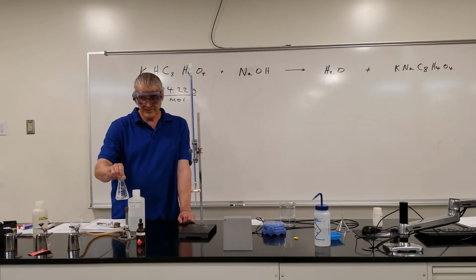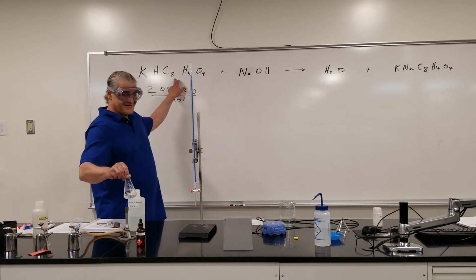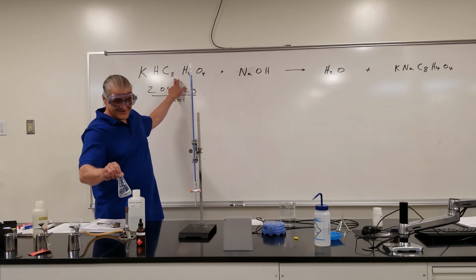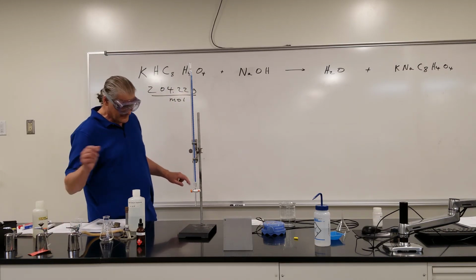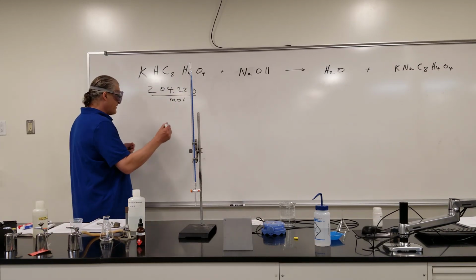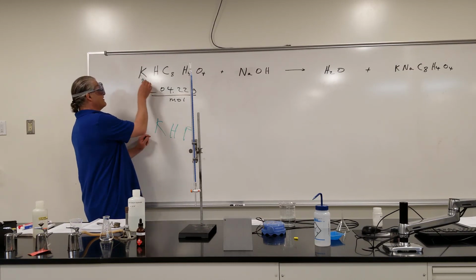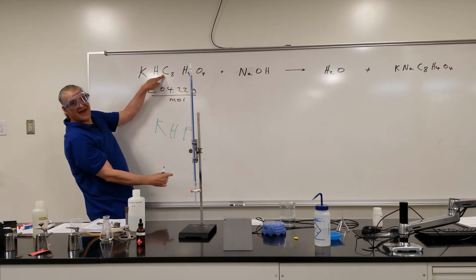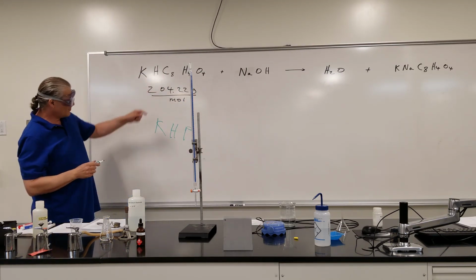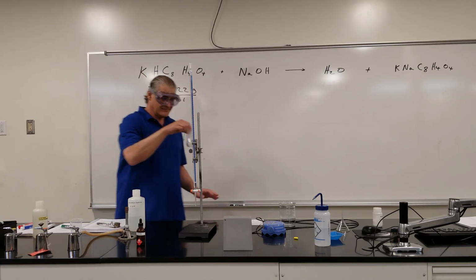You just want to warm it up enough so that your KHP, and again, that's potassium hydrogen phthalate. KHP is not potassium hydrogen phosphorus. We use a terrible abbreviation for it. All the bottles of it you see are going to say KHP, but it's potassium hydrogen phthalate. And it has this lower mass. And now that stuff should dissolve pretty quickly.